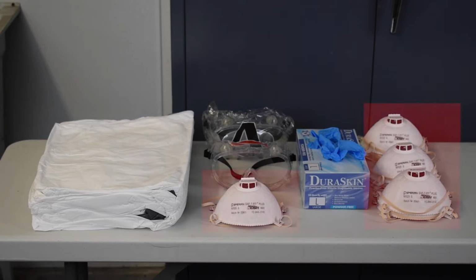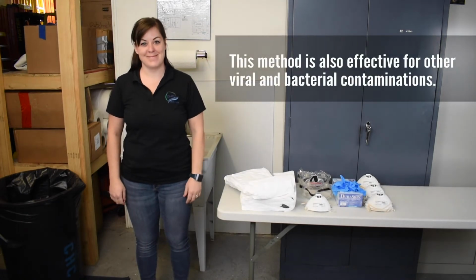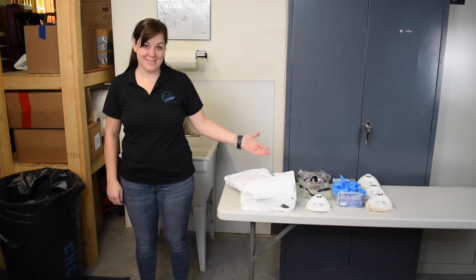Third is a NIOSH-approved N95 respirator. Fourth are goggles or a face shield. In this demonstration, we will be using goggles. In this video, Danae will be demonstrating the proper way to don and doff the required PPE.